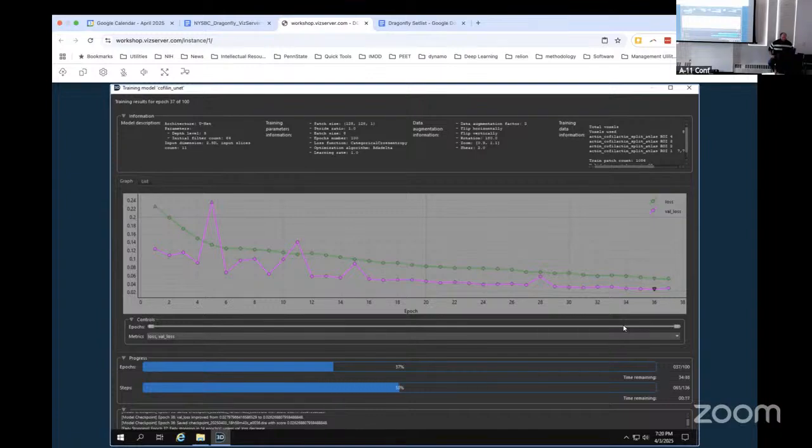Tomo Windows is the right one, even if you're doing it manually. We have figured out, as discovered, you can actually do single windows, works great with that, but without selecting operations. Anyone, single shot. Yeah.